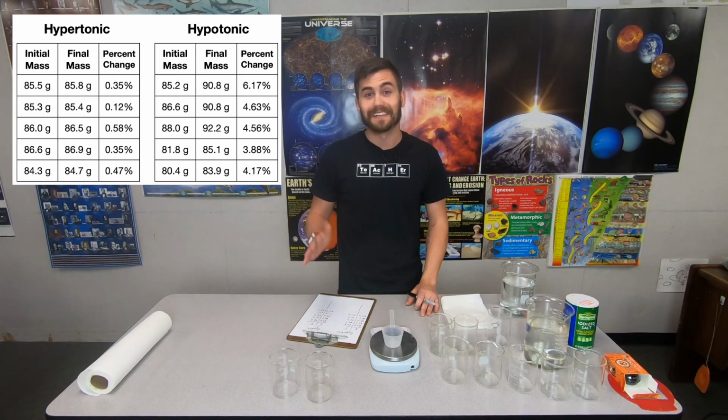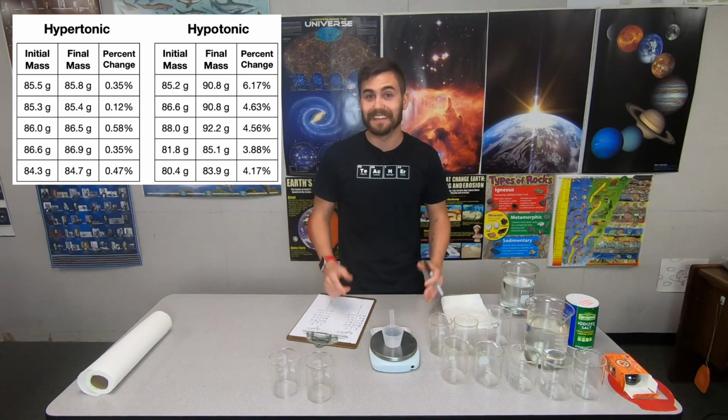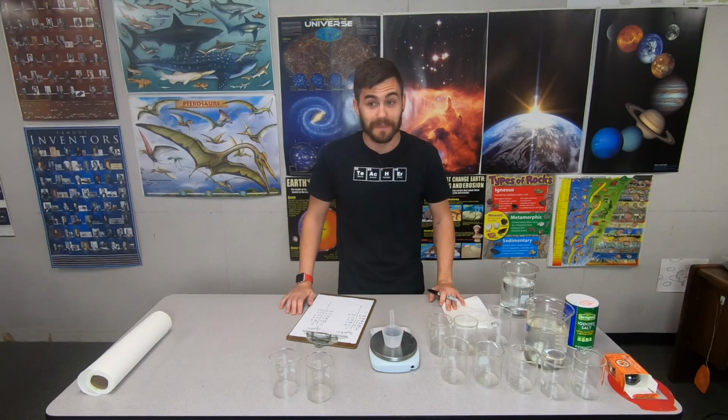So that is our lab, not the results I was looking for exactly, but I still hope you were able to learn from this. I know I did. I'll do it different next time.